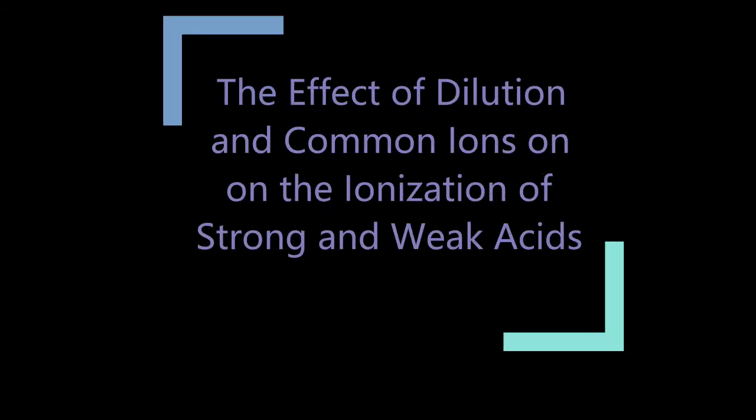This lab is called the effect of dilution and common ions on the ionization of strong and weak acids. There's also a later part which is on the Ka of chloroacetic acid, but we'll get to that later. Today we're going to look at the effect of dilution on strong and weak acids. So let's review what we're going to do first.